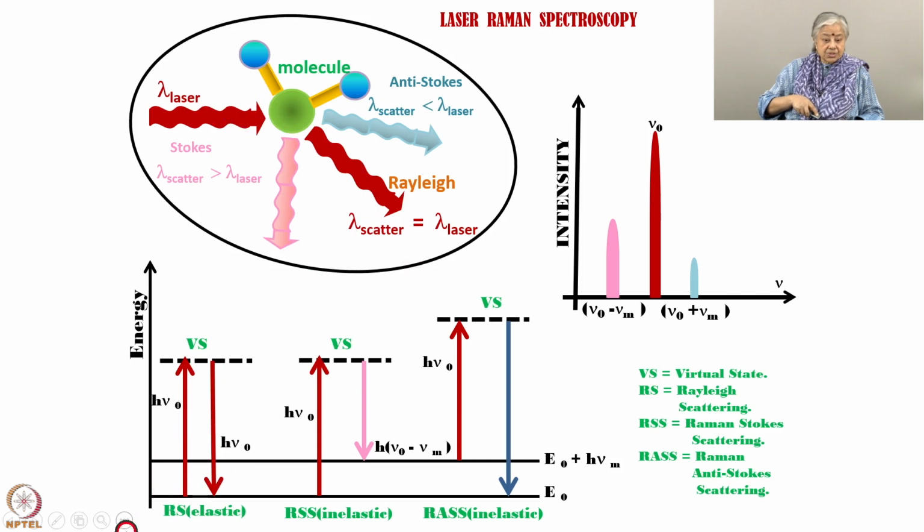So, here suppose this is the ground level, this part is E0, E0 is called the ground level, and this gives you the energy of each of those levels. Okay. So, here I am talking about a molecule, and about vibrational states. Generally these bonds start vibrating or rotating, so everything is on these bonds. Okay. So, they are vibrational levels. So, here I think of another vibrational level here.